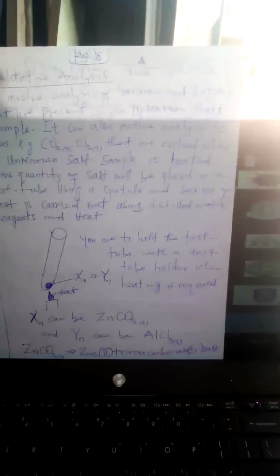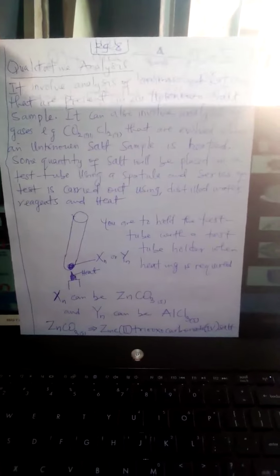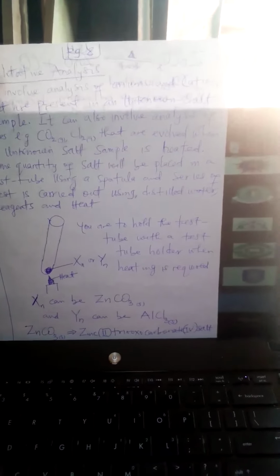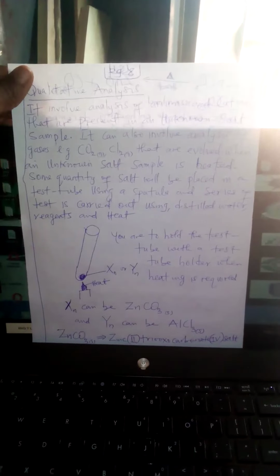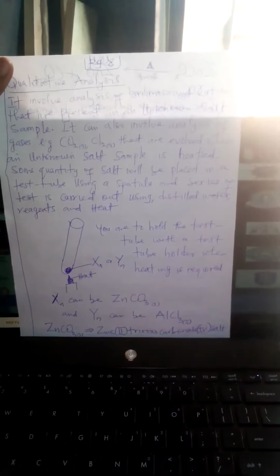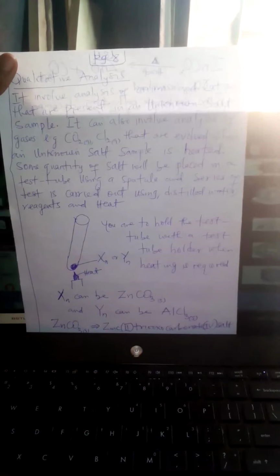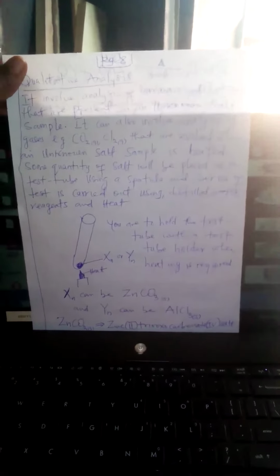So you can see, I'll quickly rush. Qualitative analysis is not clear, so I have to read it. It involves analysis of anions and cations that are present in an unknown salt sample. It can also involve analysis of gases, e.g. CO2 gas, Cl2 gas, that are evolved when an unknown salt sample is heated.